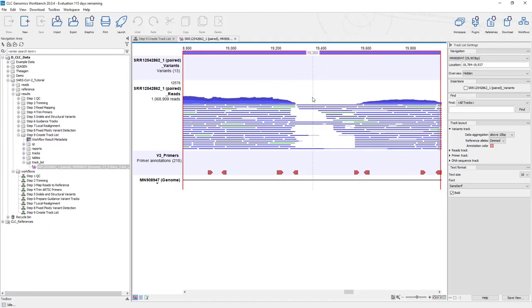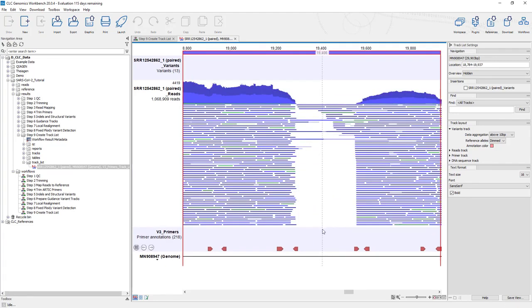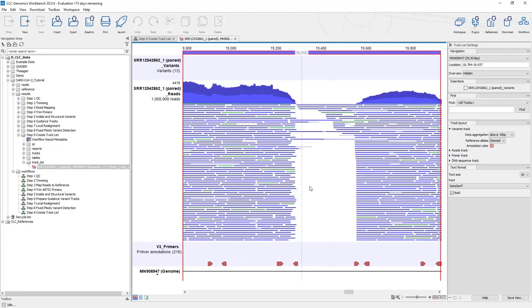So I'm going to show you how to create that coverage graph first, and that can make your visualizations a lot simpler because, when you rescale this and you have a lot of data, sometimes it'll sit there and you can see it churning through when you're trying to create this visualization. It's nice to have a faster view of that. And then we still have the consensus sequence and some additional QC functions. So we will move on to the mapping graph next.